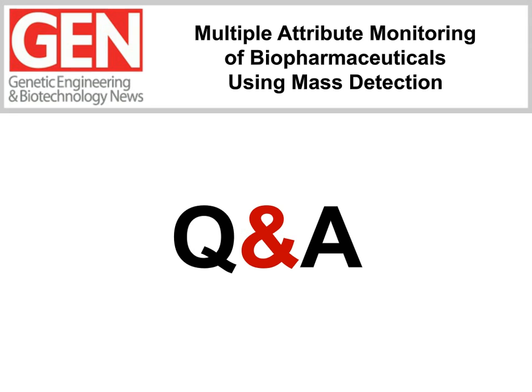One of our other questions is, how accurate is CDR peptide monitoring? So on the accuracy of the CDR peptide monitoring, I wouldn't narrow it down specifically to the CDR peptides, but the mass accuracy of the QDA, the specification is plus or minus 0.2 Dalton at the m/z range. And that's the standard performance, and that's generally the performance we see for each of the peptide applications that we've done.